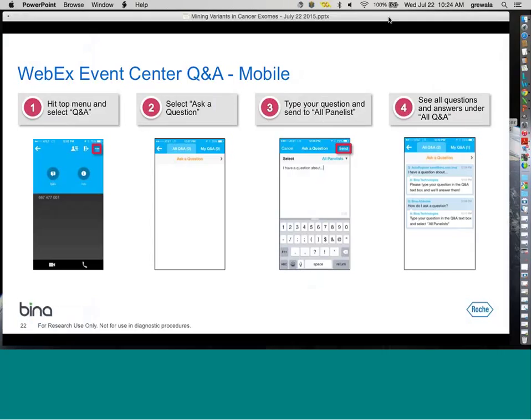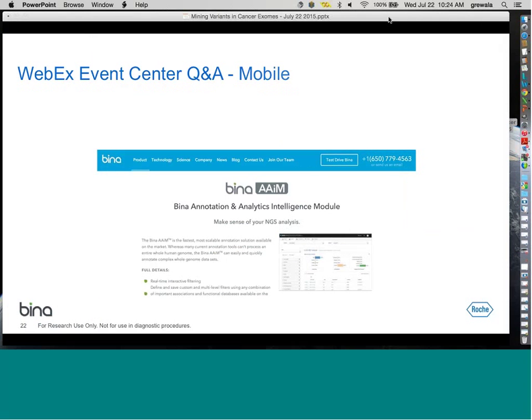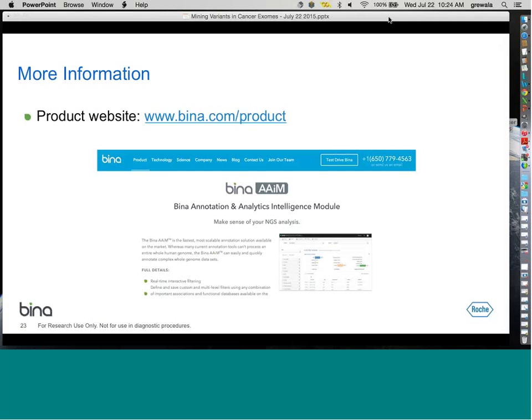There is a question about clustering analysis or principal component analysis on these samples. That's not currently something that we have in the product, but we are building out our analytic capabilities greatly. So that is something that we may have in the future. But currently, yes, the data would have to be downloaded and analyzed separately in another tool.